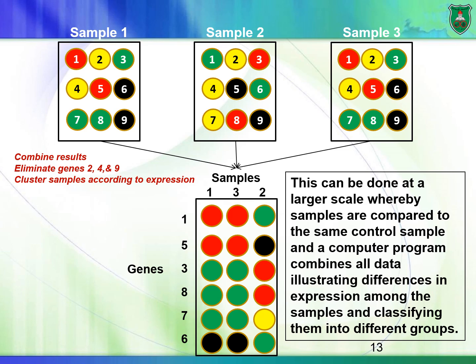The trick here is not only doing the experiment itself, it's rather the bioinformatics, that is the analysis of results. No person would be able to look at all expression of all 20,000 genes and looking at all of these spots and analyzing these spots. So it's all computer generated. And the computer not only can do 2 samples, no, it can do hundreds and thousands of samples. Okay, so we have a lot of data points.